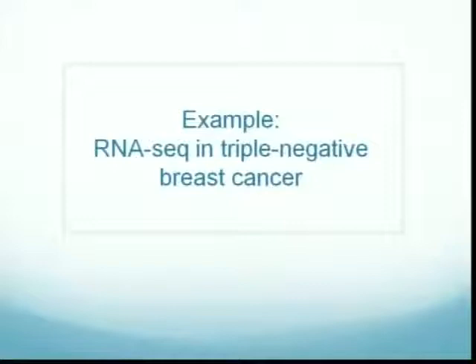So what do you think is the best balance: whether I want to go paired end or sequence more samples? Both. You have unlimited resources, Yulong. Why are you asking? Personal opinion, increase your sample size. If there's a choice between sample size and paired, increase your sample size.